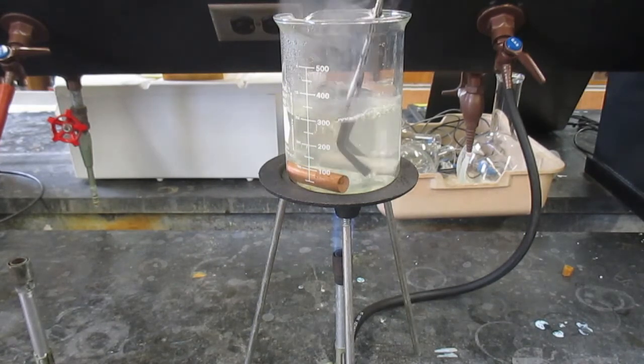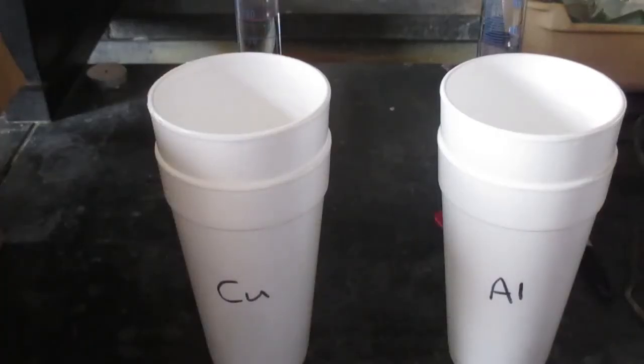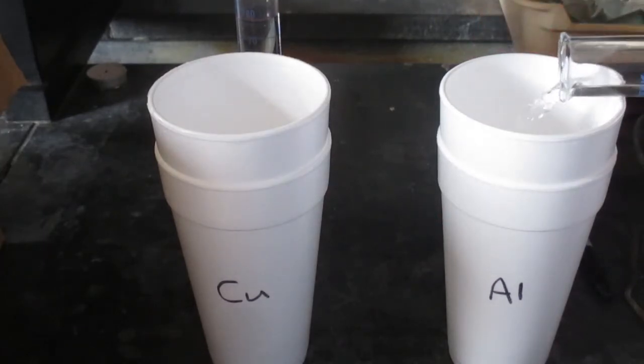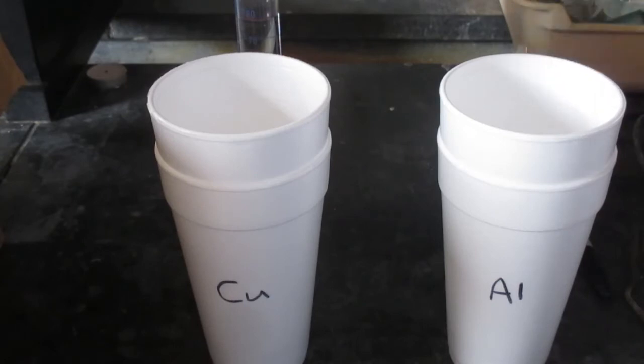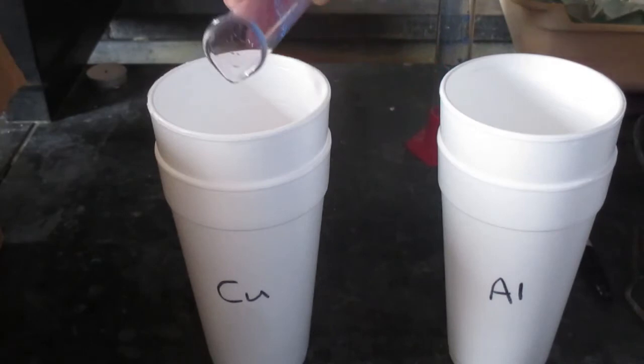I'm going to gently place the copper cylinder in and gently place the aluminum cylinder in, and let them sit in the boiling water for 15 minutes. Next, I'm going to pour 75 milliliters into each nested calorimeter — this one for the aluminum and this one for the copper.